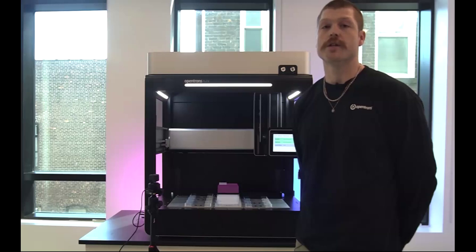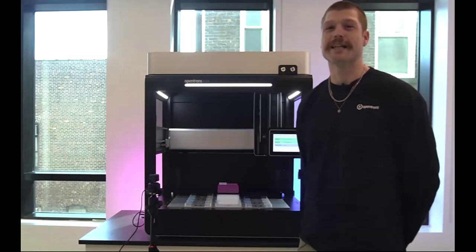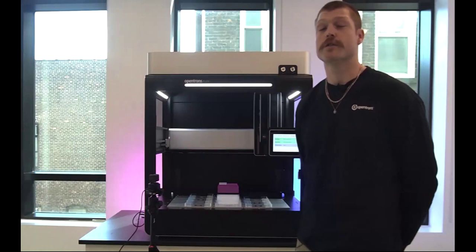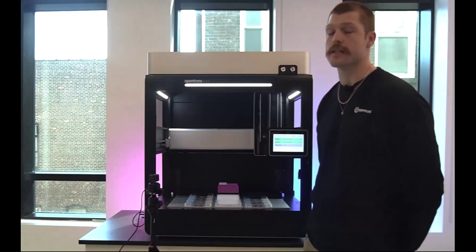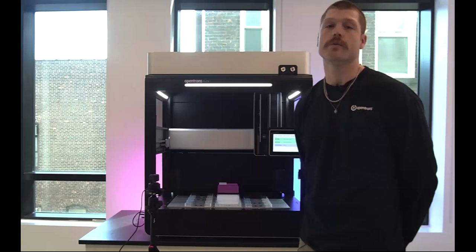What I'm going to be doing today is going over the quick transfer in two different mechanisms. The first, I'm going to walk you through really quickly, show you through the lens of the webinar, just to show what it feels like to walk up to the robot and get it prepped for it. And then the second view is going to be a screen share directly from the touchscreen display on the robot, streaming through my computer, through some kind of OpenTrons magic, just to give you a really detailed view around what is actually happening, which is difficult to capture through the actual camera screen here.